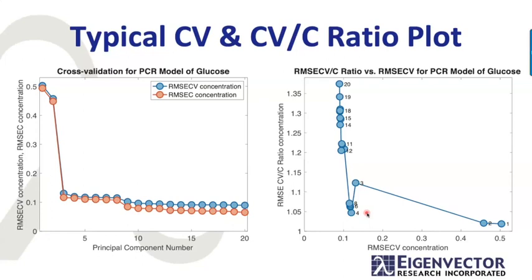We just use the root mean square error of calibration. And of course, it doesn't matter much as long as you have more than 30 samples or so. If you've got a reasonable sized data set, that adjustment for degrees of freedom doesn't really make a lot of difference. Okay. Anything else? No, we're good. Okay.